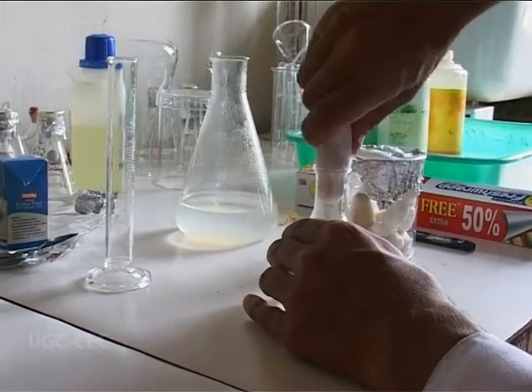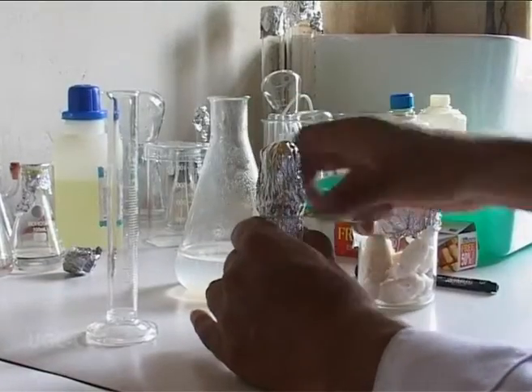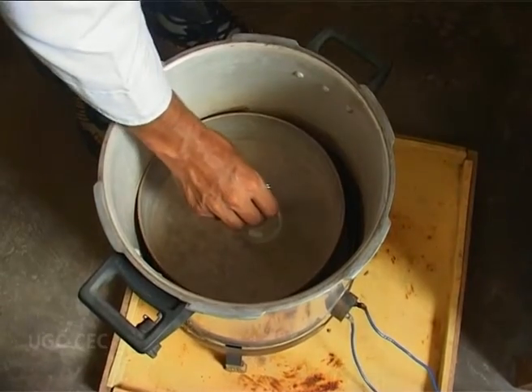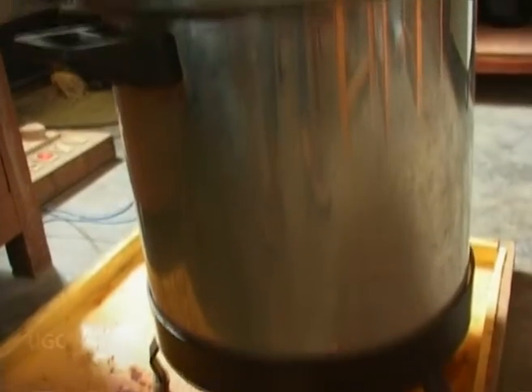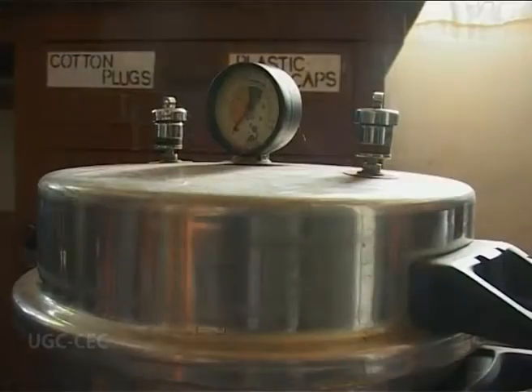Culture vessels are plugged with non-absorbent cotton plugs. After this, the vessels are covered with aluminium foil. For sterilizing the culture medium, it is autoclaved at a temperature of 121 degrees Celsius and at a pressure of 15 lb for 15 minutes. Finally, the autoclaved medium is stored in the cabinets in inoculation room.